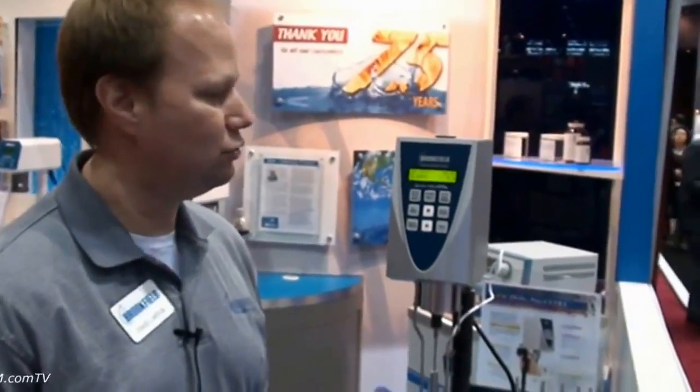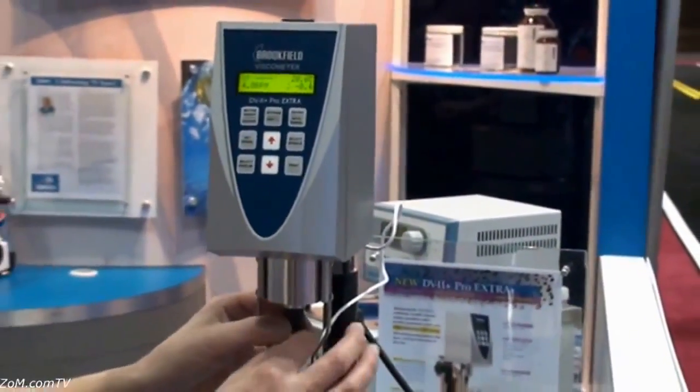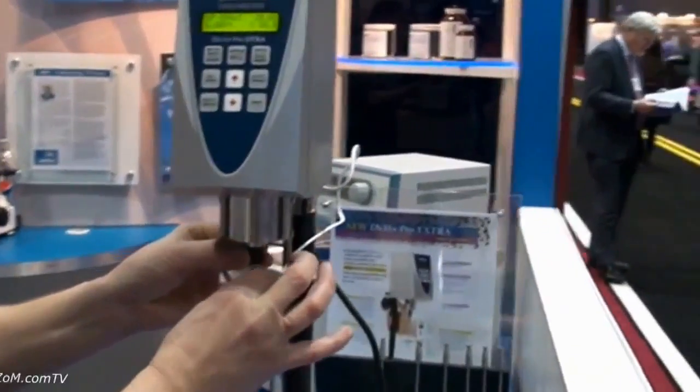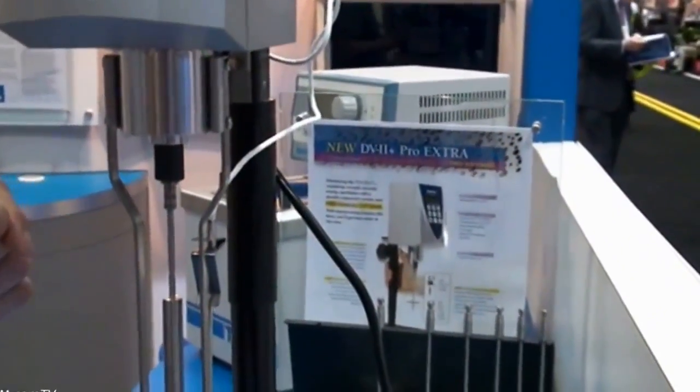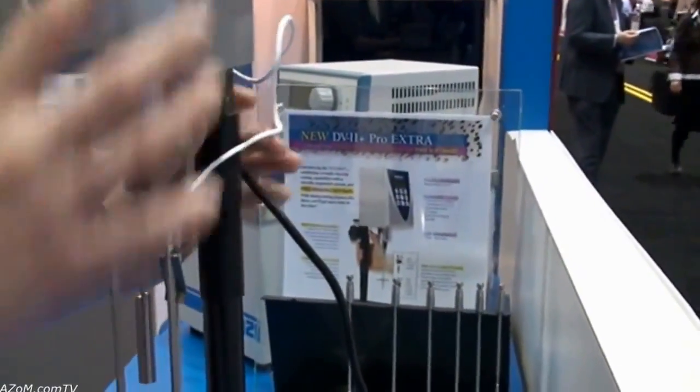This is our most common model. It's the DV2 Plus viscometer, and we've done a few things by adding a quick connect spindle — that is new for us — and a quick moving spring-loaded lab stand.